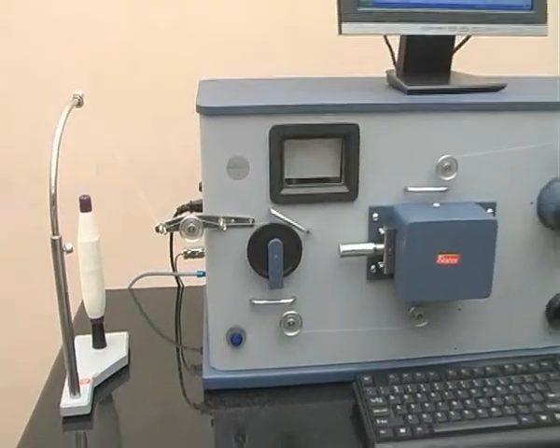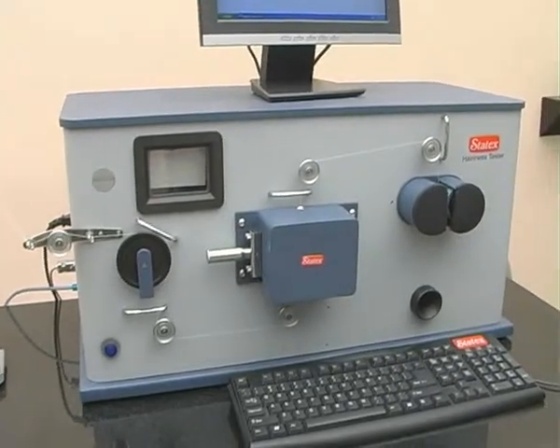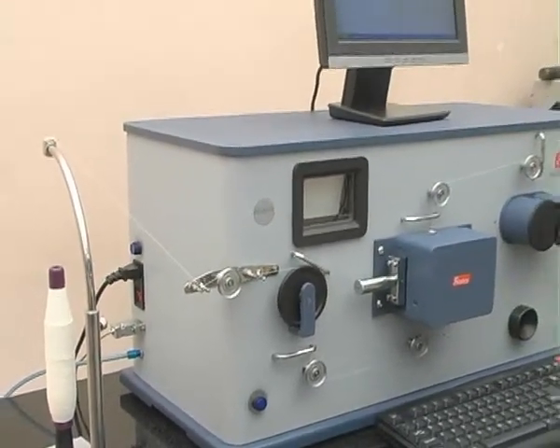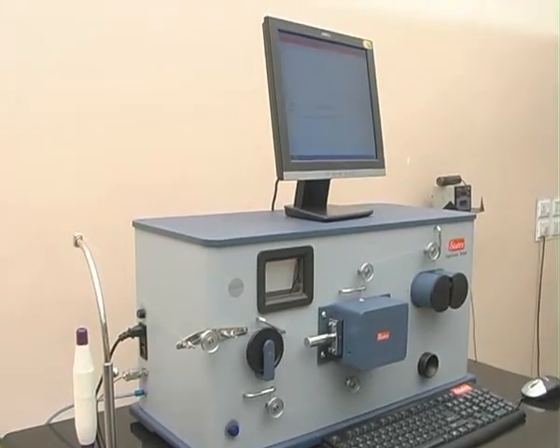An appropriate testing speed of 50 meters per minute is ideal for testing hairiness. If the speed is above 50 meters per minute, the protruded fibers will tend to bend towards the yarn, resulting in an error in hairiness counting.